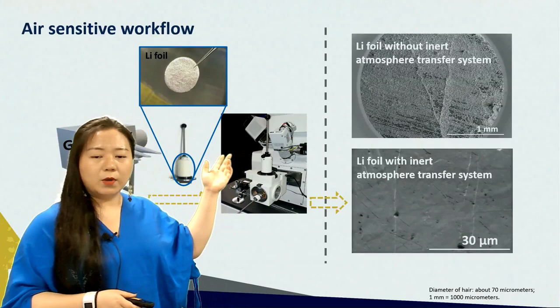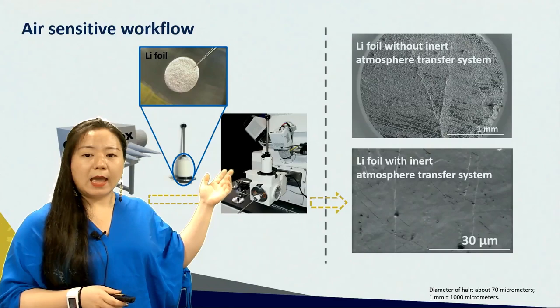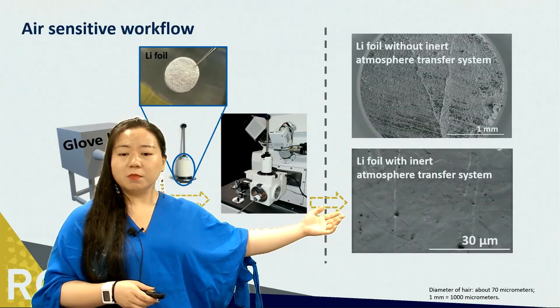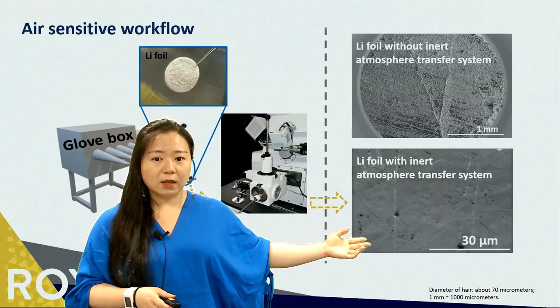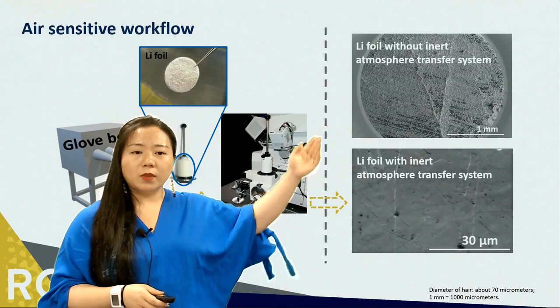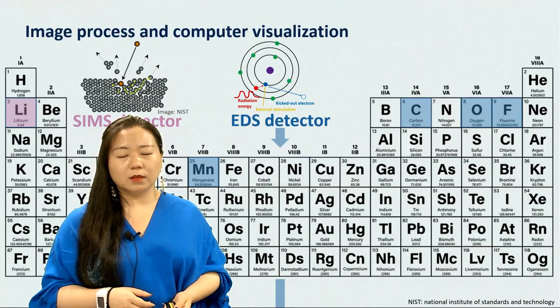Here we also use an air-sensitive workflow, which is able to protect the electrodes since they are air-sensitive and moisture-sensitive. The right side of this slide shows a comparison of lithium foils with and without such a system. We can see that the lithium foil with this inert atmosphere transfer system is quite clean, almost with no oxidation on the surface. However, the lithium foil without such a system oxidizes very fast.